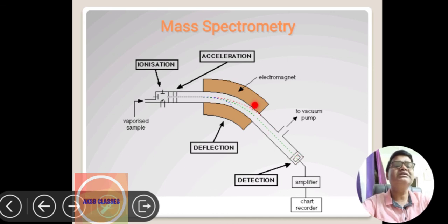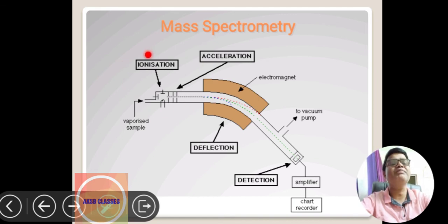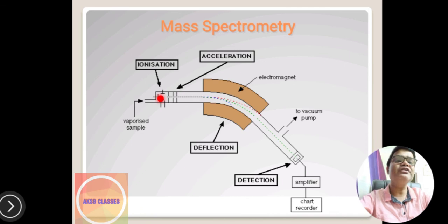So this is the first unit, where there is ionization. Ionization is an essential process for detection of any unknown sample or unknown protein. So what will happen in ionization? In the presence of laser and high heat, the sample, which is in a liquid condensed form, is going to vaporize and convert into a vaporized gaseous form that contains charged ions.